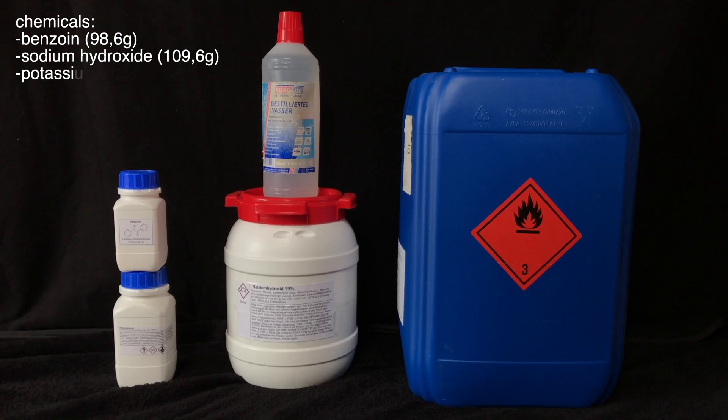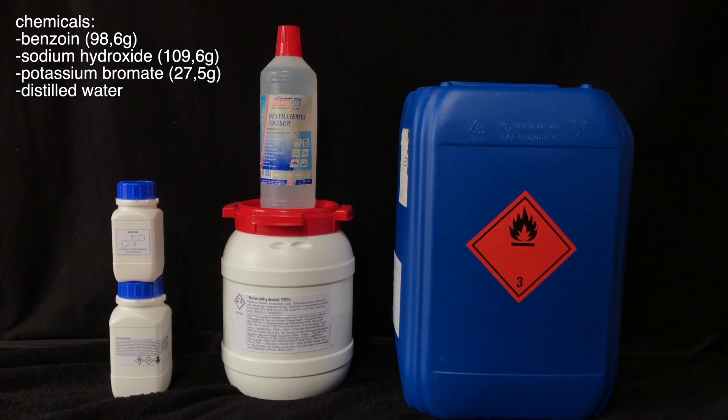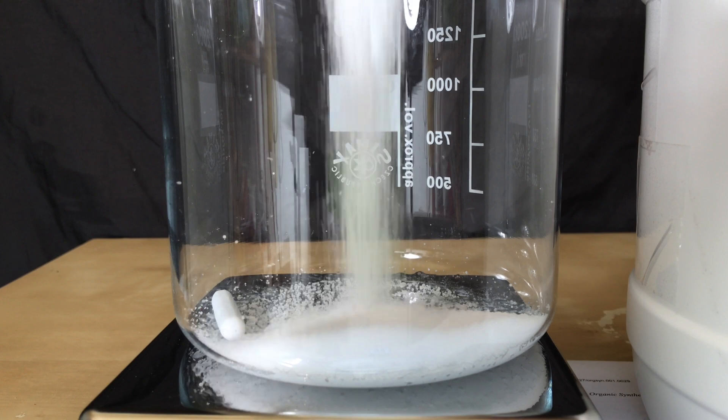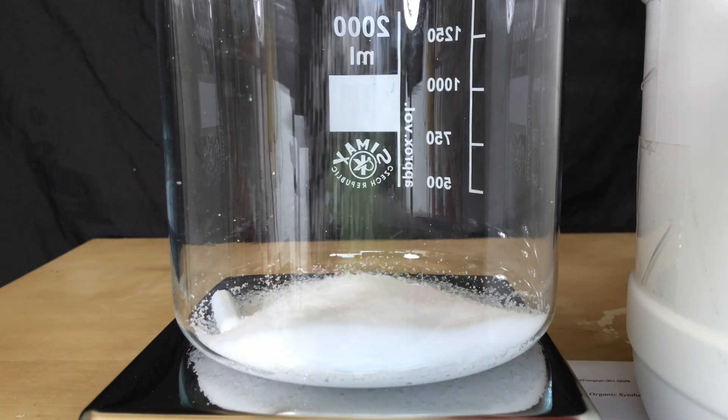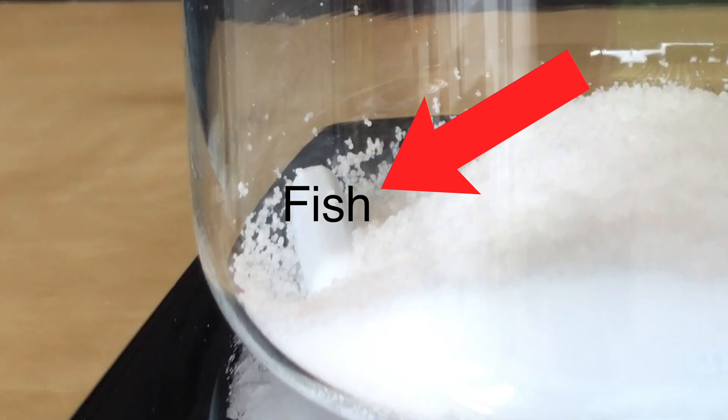For the preparation we're going to need 98.6 grams of benzoin, 109.6 grams of sodium hydroxide, 27.5 grams of potassium bromate, and a lot of distilled water. We then began by adding the sodium hydroxide to a beaker which already contained the stir fish.